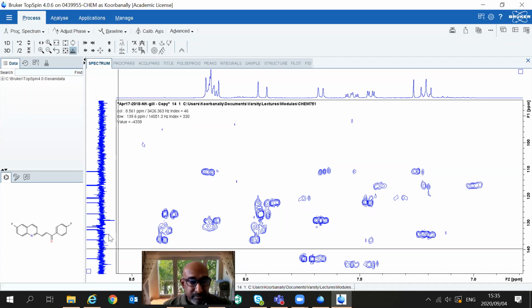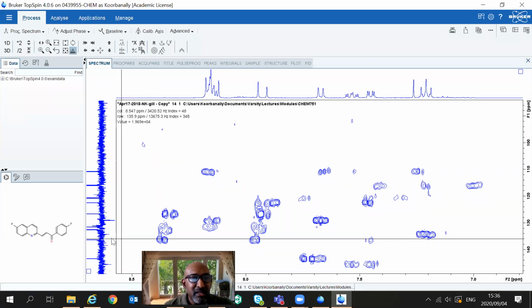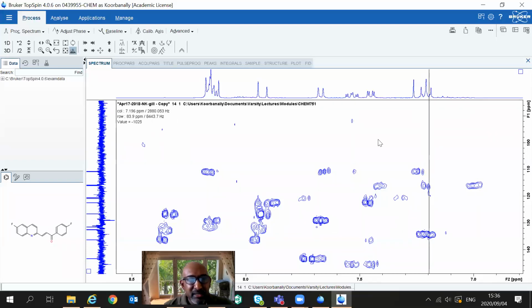But now, if I look at this particular example, I can look at this in my HMBC. So I'm looking particularly at the singlet that you see here. And if I look at the singlet you're seeing here, I'm picking up a very nice correlation to this. Because I'm picking up such a nice correlation, I know exactly what this is, and that's these two here.